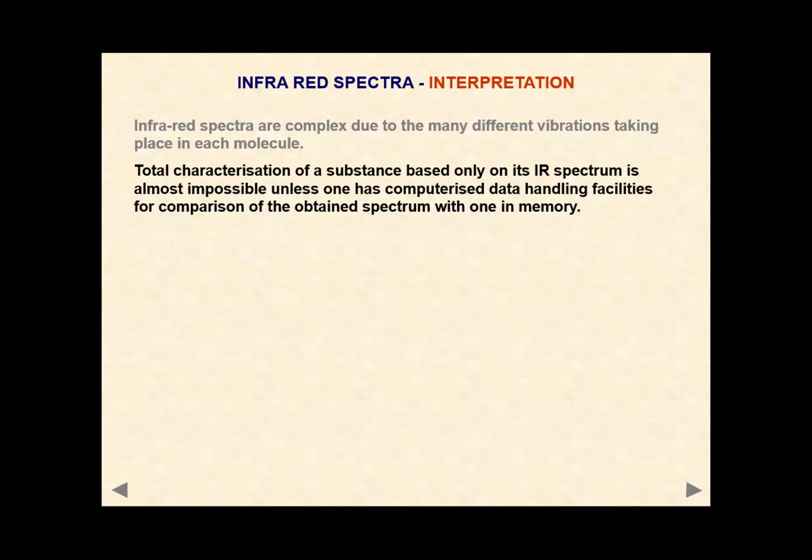Oh, this frequency matches with C double bond. Oh, okay, fine, this is C double bond. Oh, this frequency matches with OH bond, so this is the OH bond frequency. So in this way we interpret different types of peaks, right, Anika? Yes.